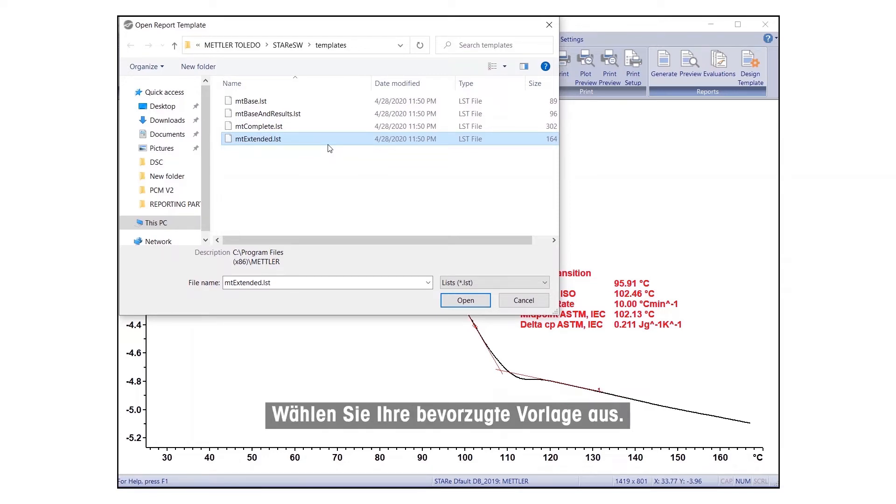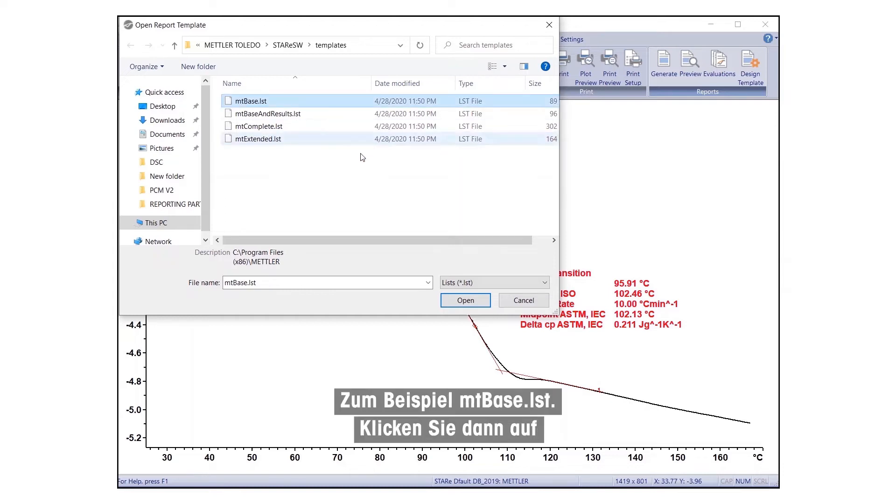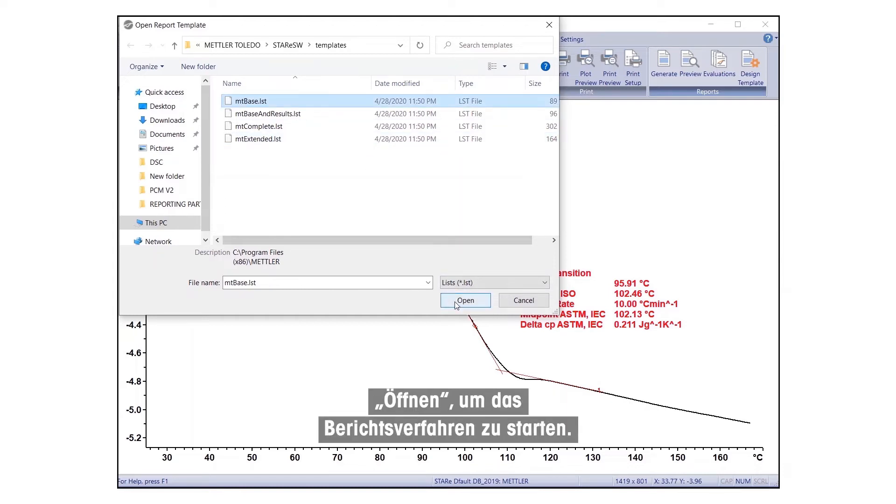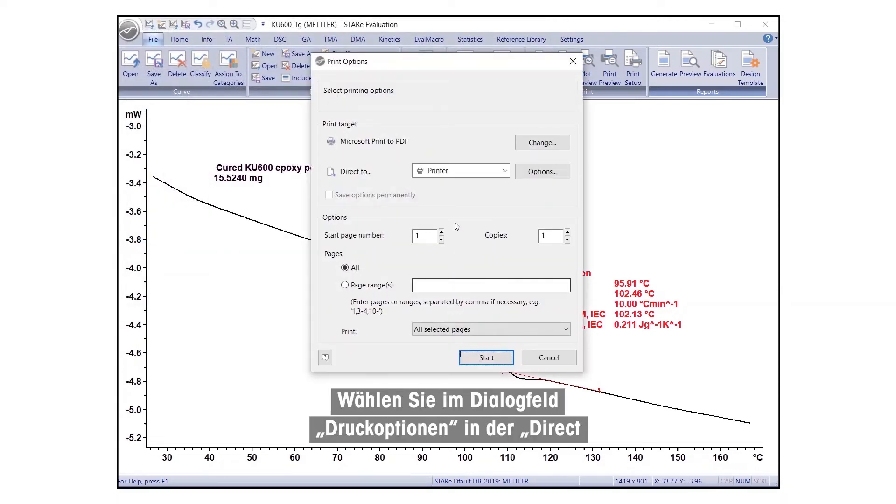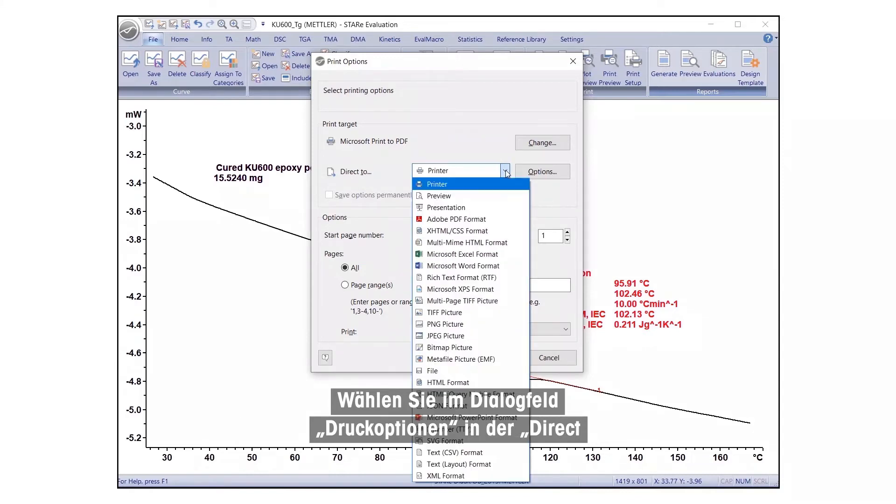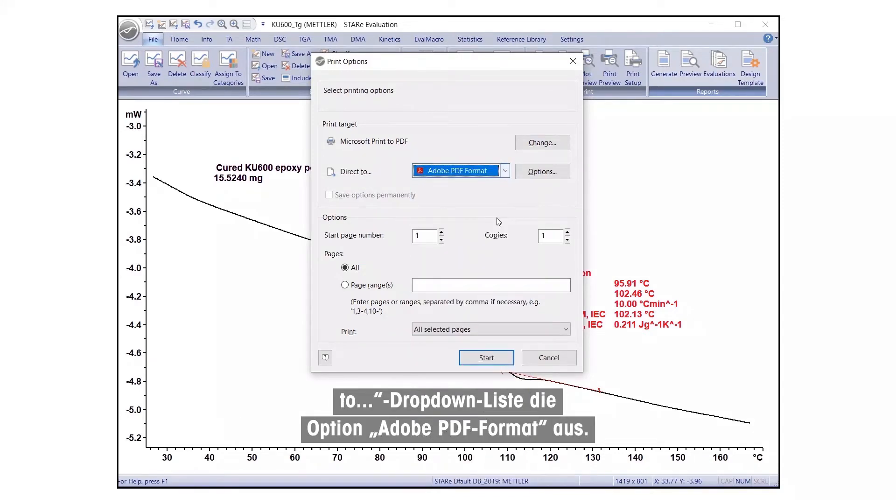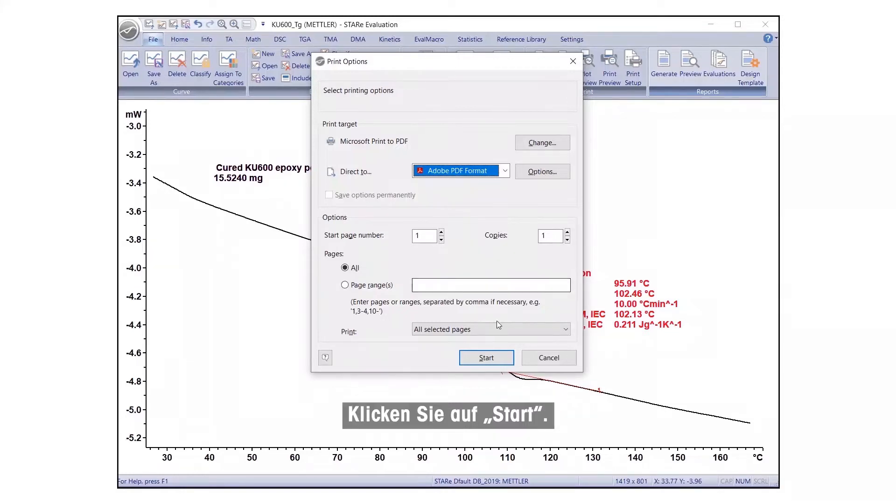Select your preferred template, for example, MT-Base.LST, and click Open to initiate the reporting procedure. In the Print Options dialog box, select Adobe PDF Format from the Direct To drop-down list. Click on Start.